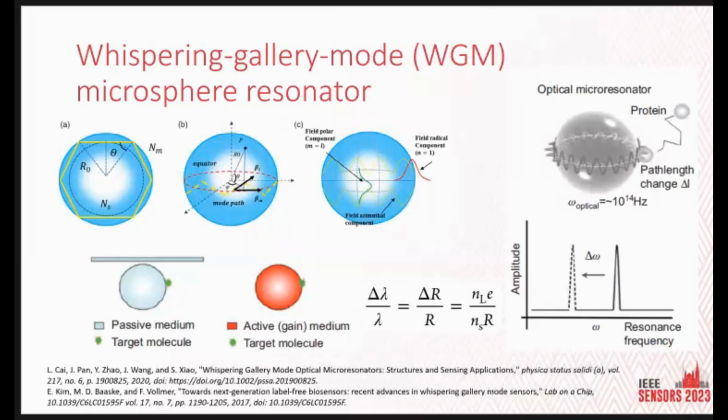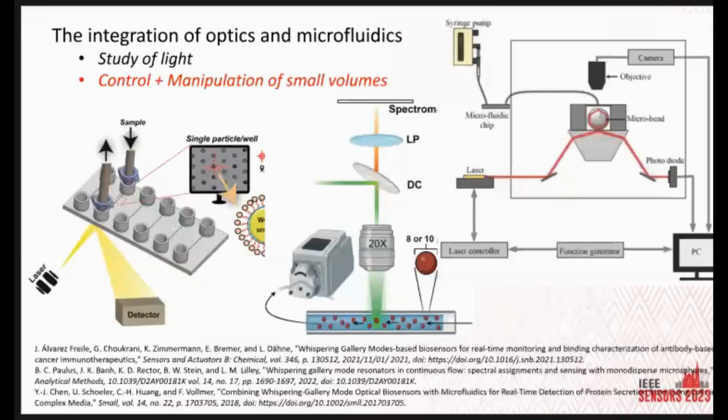So when we want to combine these with microfluidic platforms, eventually lab-on-chip devices, we can see that some papers showing there's some work in these areas already, but you can see most of them are using a pump to drive liquids through the microfluidic devices, or even some of them will have the detection unit, as shown in the right hand figure, outside the chip.